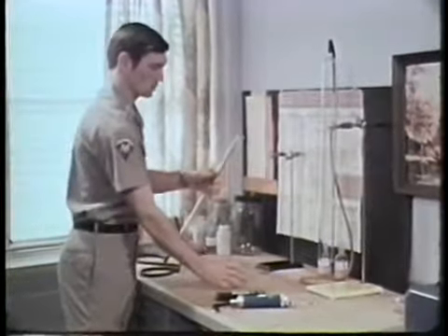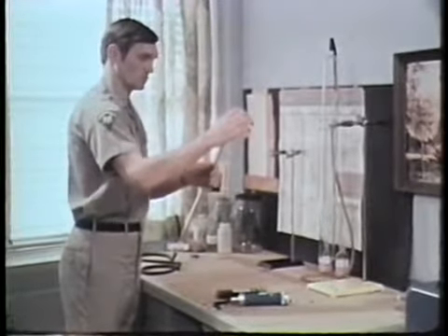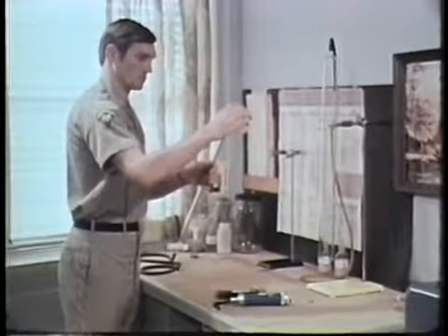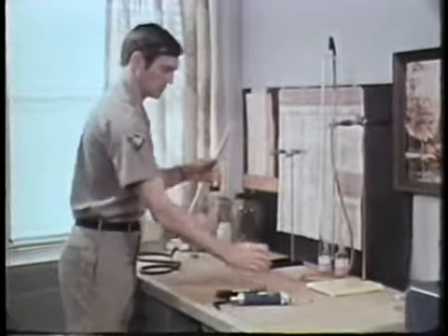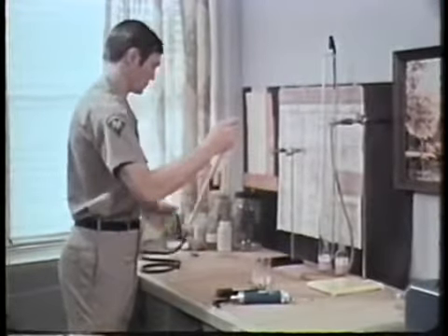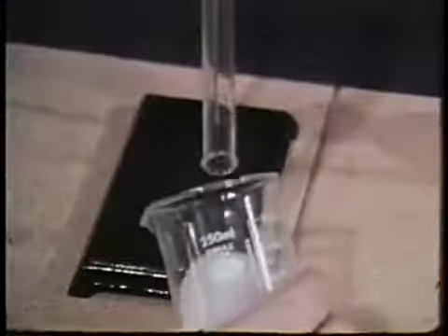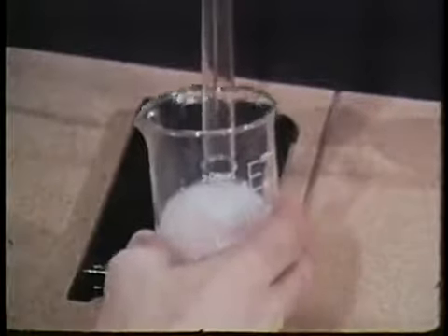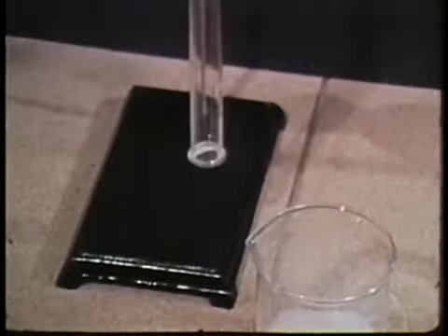The next step is to thoroughly coat the inside of a 100 milliliter burette with the detergent and water solution. When you touch the burette to the surface of the solution, a soap film forms at the mouth.